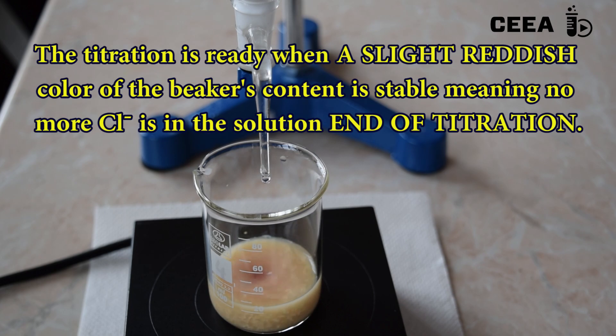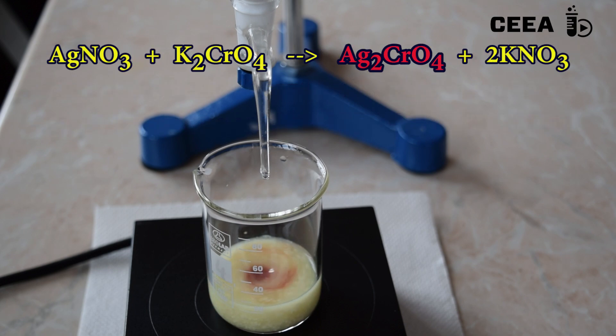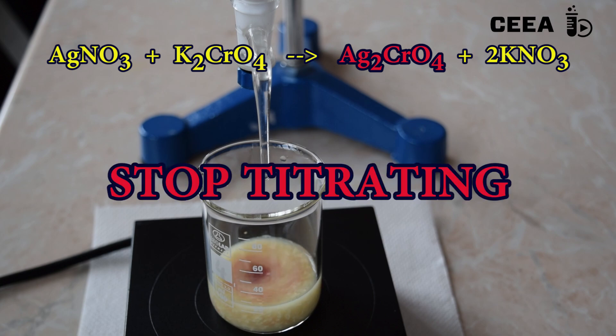The titration is ready when a slight reddish color in the sample is stable. This is due to the red silver chromate precipitate which forms only after the entire amount of chloride was precipitated.